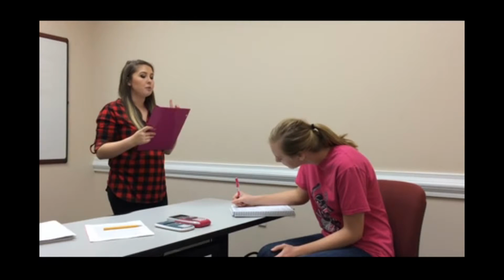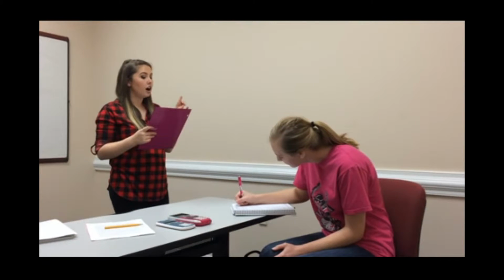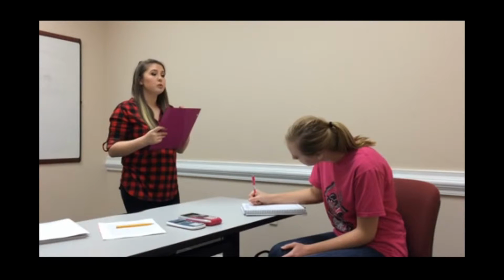Yes? Ms. Nyrider, what instruments will we be using in this experiment? That's an excellent question. We're going to use a 50 milliliter beaker, a 100 milliliter beaker, a hot plate, an unknown hydrate, zinc metal, which will be powdered, iodine, 0.2 molar acetic acid, a crucible and a cover, a Bunsen burner, an iron ring, a ring stand, and wire gauze. Any more questions? Nope, I think that's good.